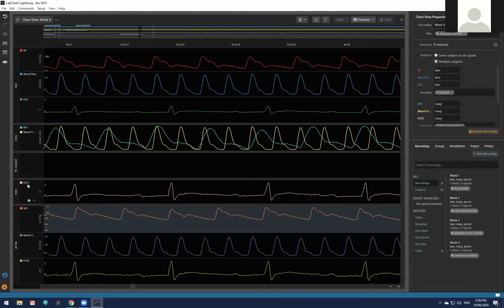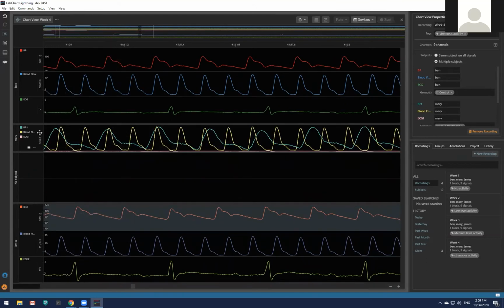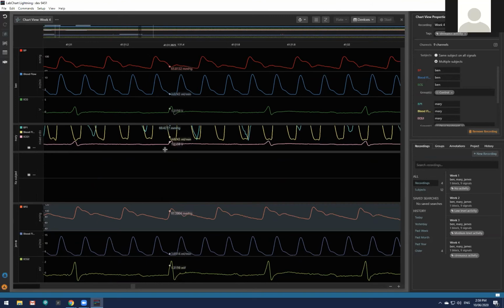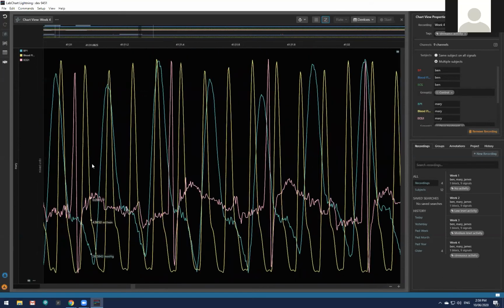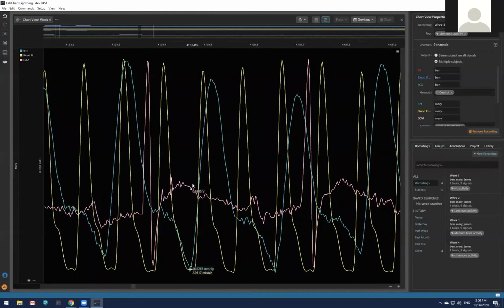We can also do the same with another signal. So you can overlay all the signals together if you like. That's not a problem. And you can double click here, so actually we can blow this up to make it a bit easier to see. And we have the option to auto scale. What you see here is all 3 signals simultaneously put together.